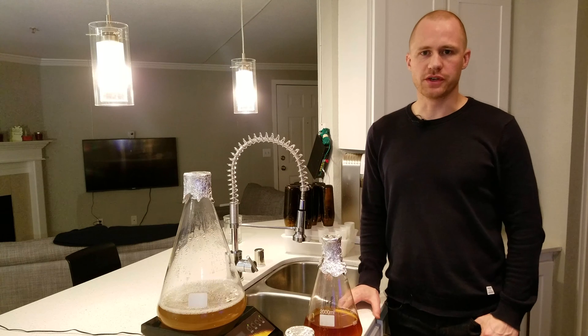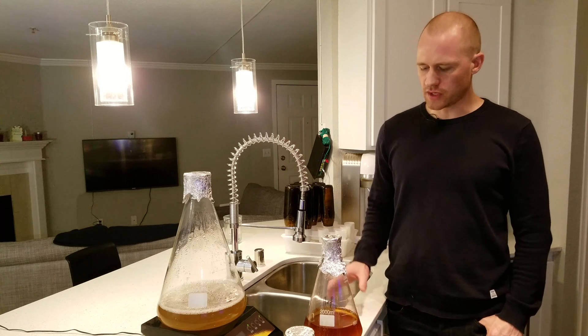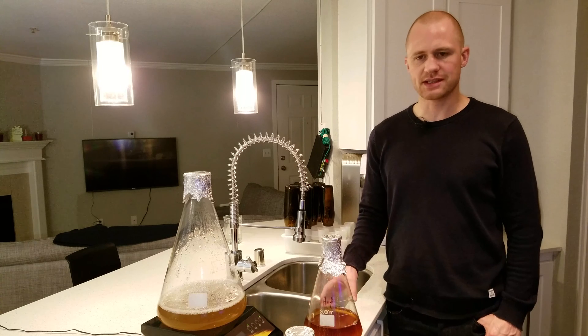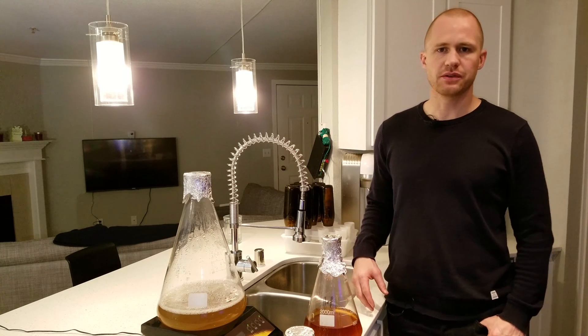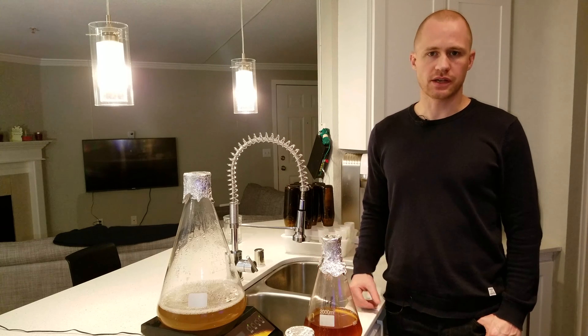Welcome brewers and lab nerds. Today I'm going to show you how to revitalize your yeast. If you started your yeast starter a bit too early and you now have yeast that does not have the amount of cells that you want that are alive, then there are a couple of things you can do.